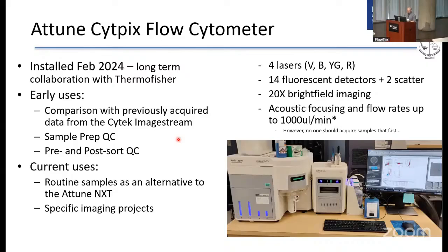Since then, we've developed our uses a little bit. We've got some specific imaging projects, which I'll cover, and it's also routinely used as an alternative to the NXT. Fortunately or unfortunately, that happens to be the majority of usage for this instrument, but hopefully we'll get some more interest as time goes on for specific imaging projects.